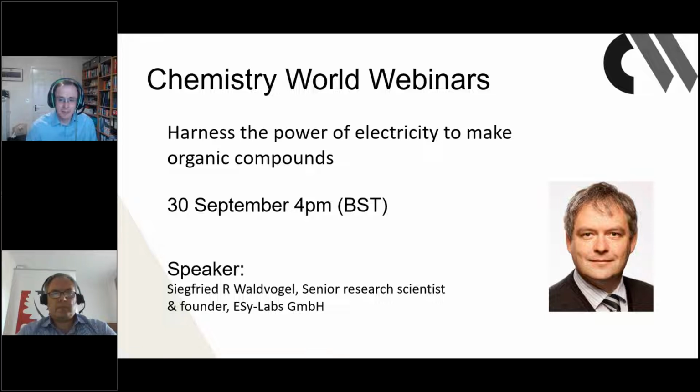So today's webinar is about using electrochemistry, electrosynthesis to make organic molecules using batch type electrochemical reactors. Electrochemistry opens up a whole load of interesting new modes of reactivity, but it does require different equipment that may not be familiar to everyone in standard labs. So the point of this webinar, one of them, is that by the end, you should be able to understand how to get the best out of electrochemical batch reactors and how to handle some of the equipment properly.